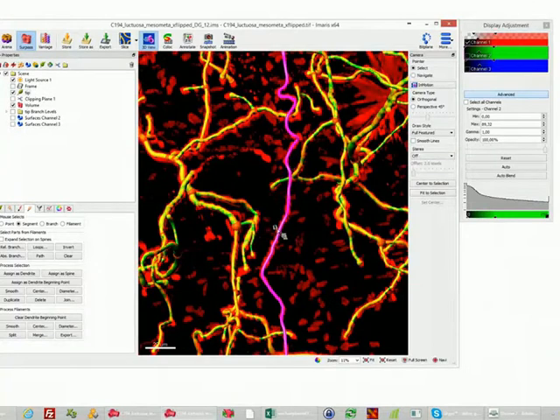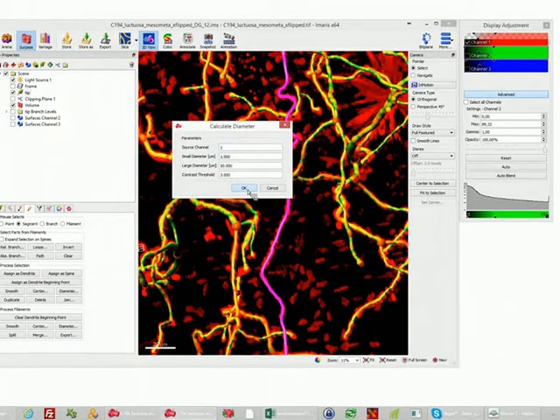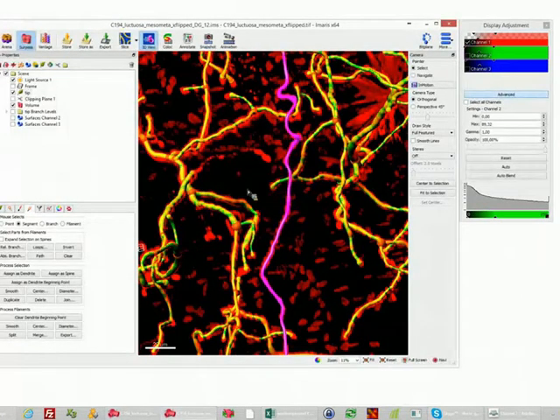So this is fine-tuned. The next thing you may notice is that the diameter is constant. In principle, I could draw different diameters by just resizing my drawing box with the mouse wheel, but I didn't do this. What you can do now is calculate the diameter automatically by using the diameter tool. I just use the defaults here for the parameters, which work in most cases, and now you see that this is resized.